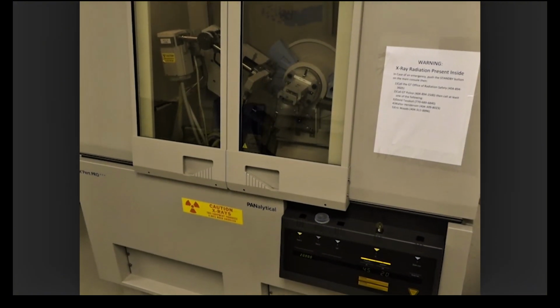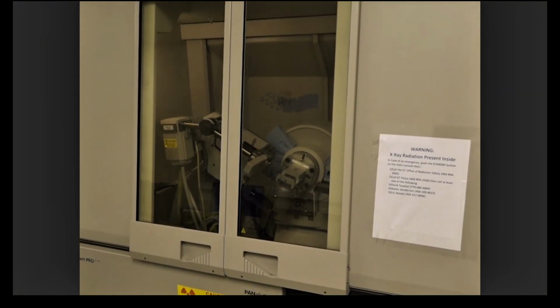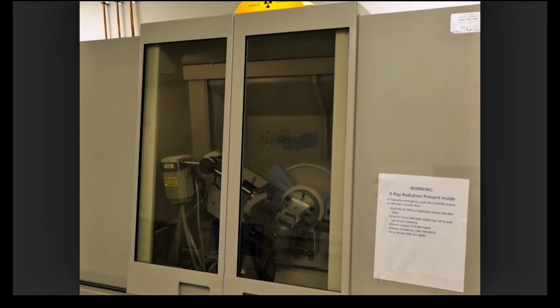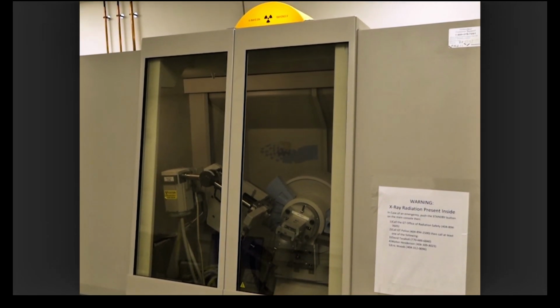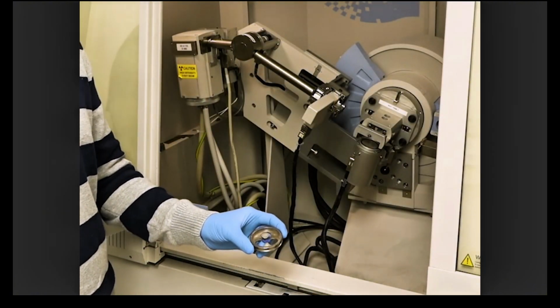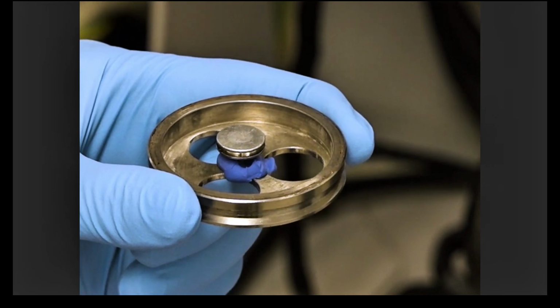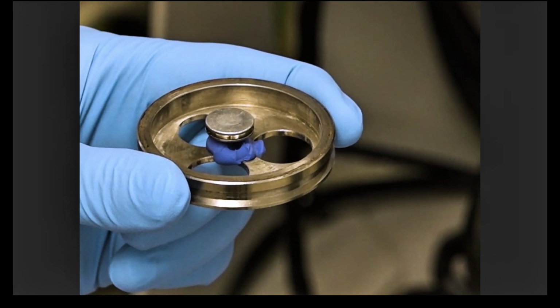Before starting, carefully inspect the XRD instrument and assess its status and safety. XRD users must be trained in basic radiation safety before having access to the instrument. Then proceed with sample preparation. In this experiment, we use a nickel powder sample in the form of a pressed pellet. It is important that the sample is not thin, and it should be at least 3 times thicker than the attenuation length of the X-rays.